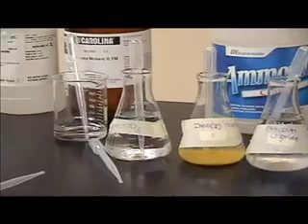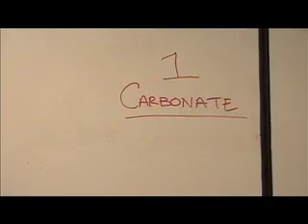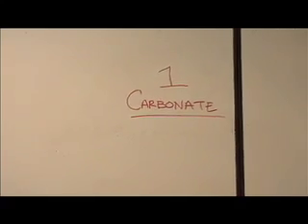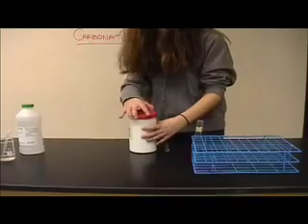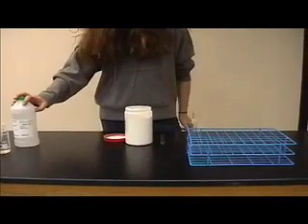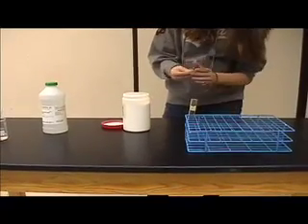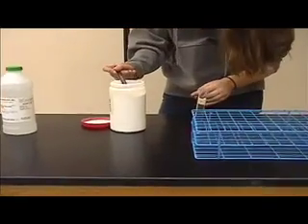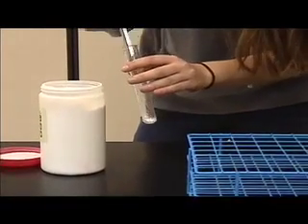We're also going to need some concentrated sulfuric acid, which we're going to get out later. So the first anion we're going to be testing for today is carbonate. And to test for this anion, you can use any dilute mineral acid. But today we're going to be using dilute hydrochloric acid. So we're going to take our washed scoopula, scoop out just a pinch of the carbonate, and put it into our clean test tube.